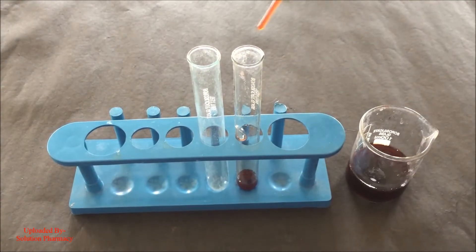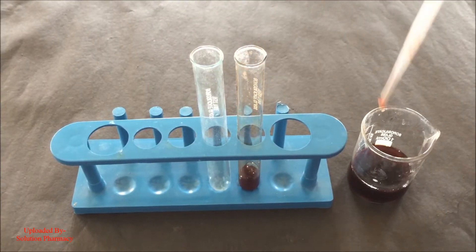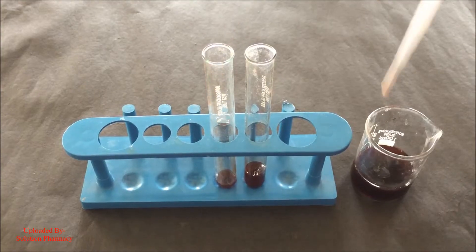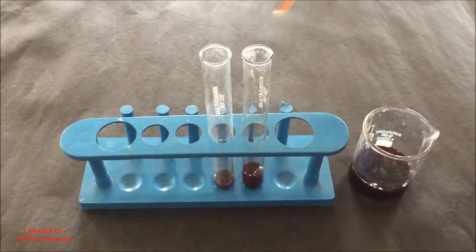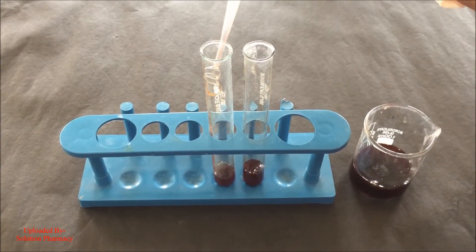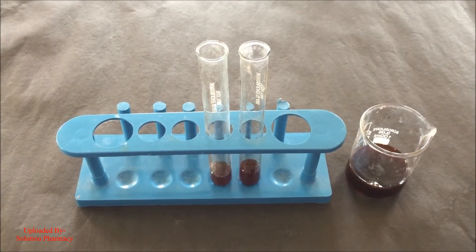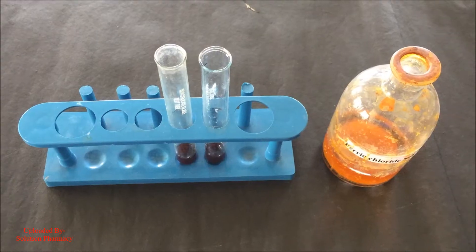Transfer an equal amount of the aqueous extract into the second test tube. The second test tube is taken here for comparison of the change in color of the extract after performing the test. After transferring 2 ml of the extract to both test tubes, now we are going to perform the ferric chloride test.